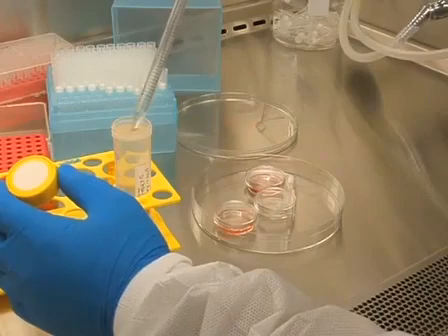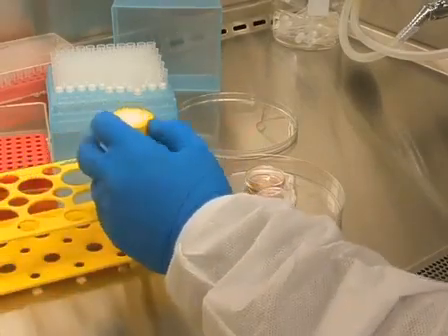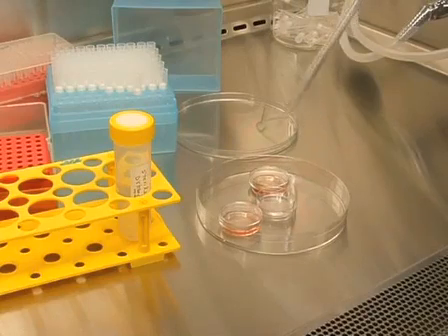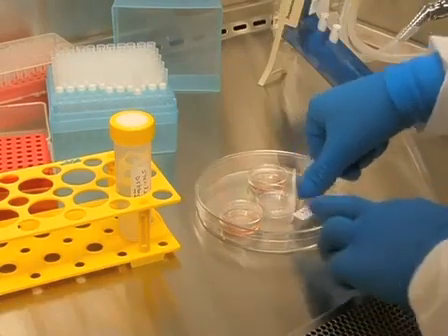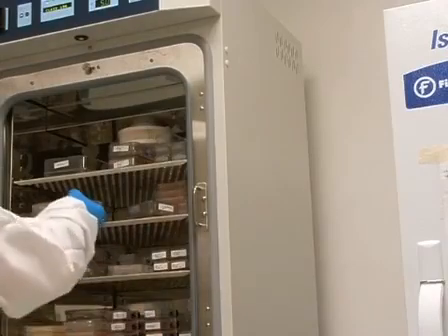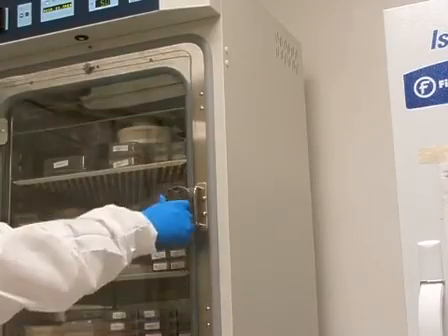3 ml of sterile water is added to an open 35 mm dish placed alongside the culture dishes in the large Petri plate. This helps maintain optimal humidity during the incubation period. Label the plate and transfer to an incubator set at 37 degrees Celsius, 5% carbon dioxide and 95% humidity. It is important not to disturb the culture during the first hours so that the collagen can congeal.